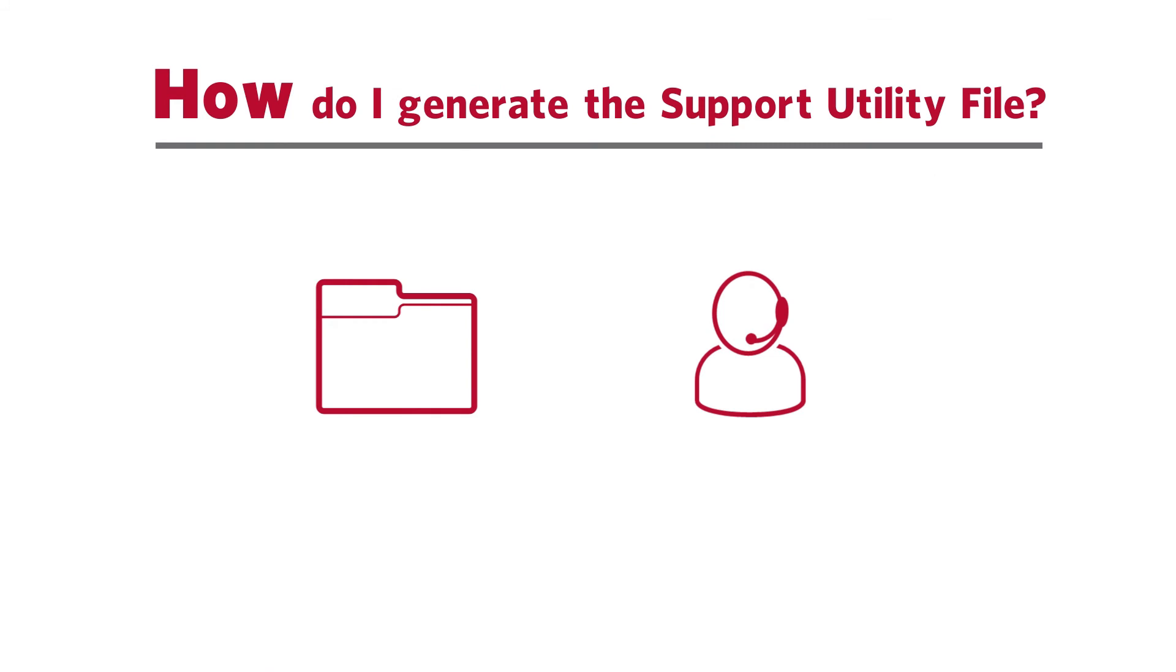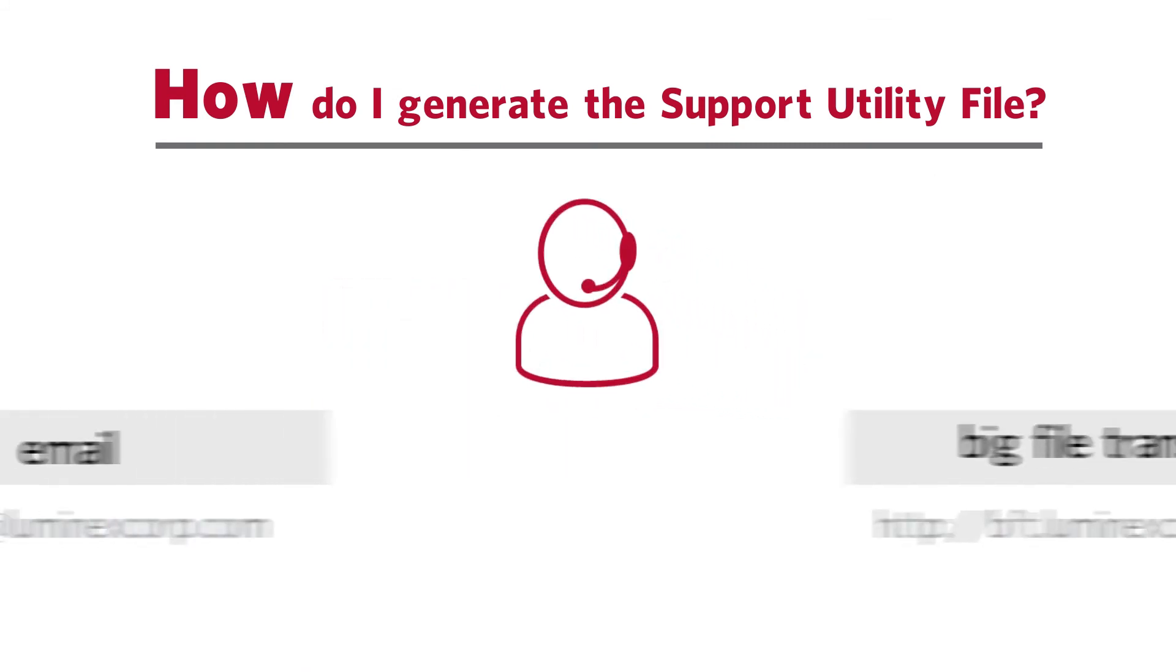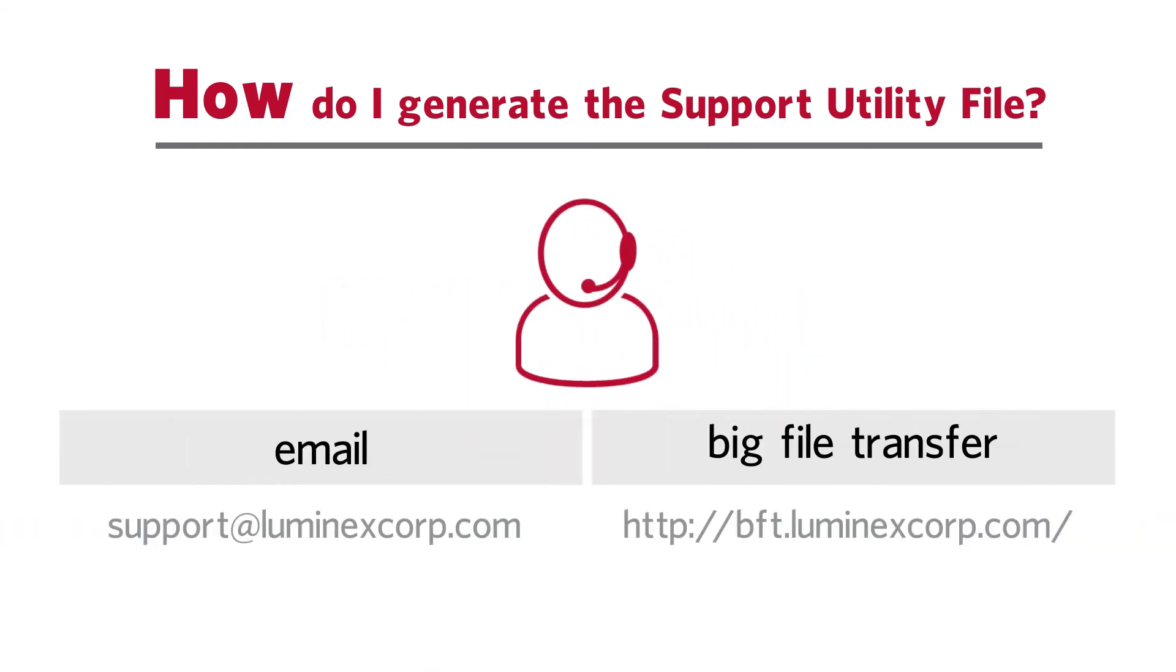Finally, locate the .zip file and send the file to Luminex Technical Support. If the file exceeds the limit to send via email, use the big file transfer.